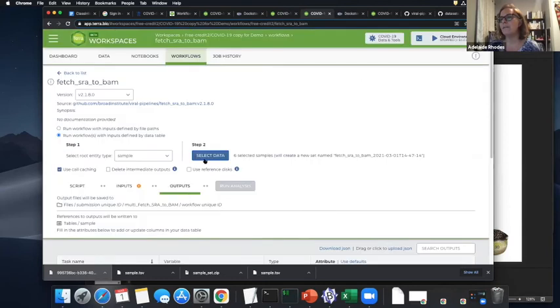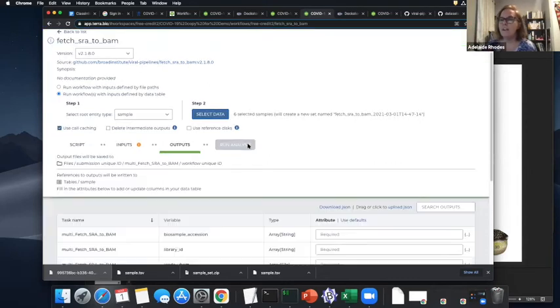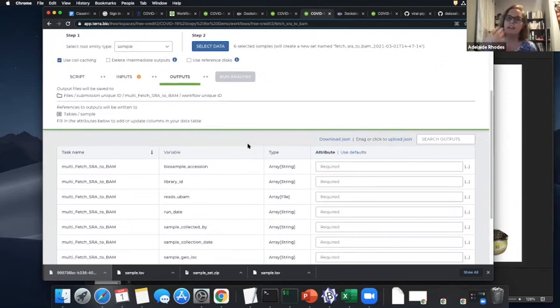The thing is, what I would like to do is have it be automated so that it would read my data table. For anything that's already been successfully run, it would ignore it, or things that were unsuccessfully run and we didn't have a good output, ignore those too. I would like to be pointing at the GCP bucket or using BigQuery to filter down my new SRR data sets to bring in and not waste time rerunning the analysis that I already did.